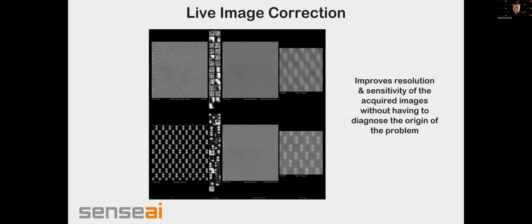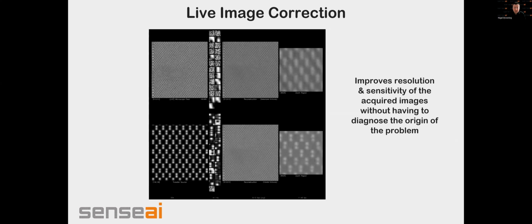At the bottom, what we've done is take a simulation of the silicon dumbbells that you would expect under the imaging conditions of the microscope. In this case, we're not subject to the signal to noise, so we get a high quality image. If you now do the reconstruction of your image, you actually get back to getting your silicon dumbbells. So by using the dictionary while we're working on the microscope, and I'll show in a minute what we can do after we finish on the microscope, you can correct for minor errors in the alignment or the acquisition of your images in the microscope.